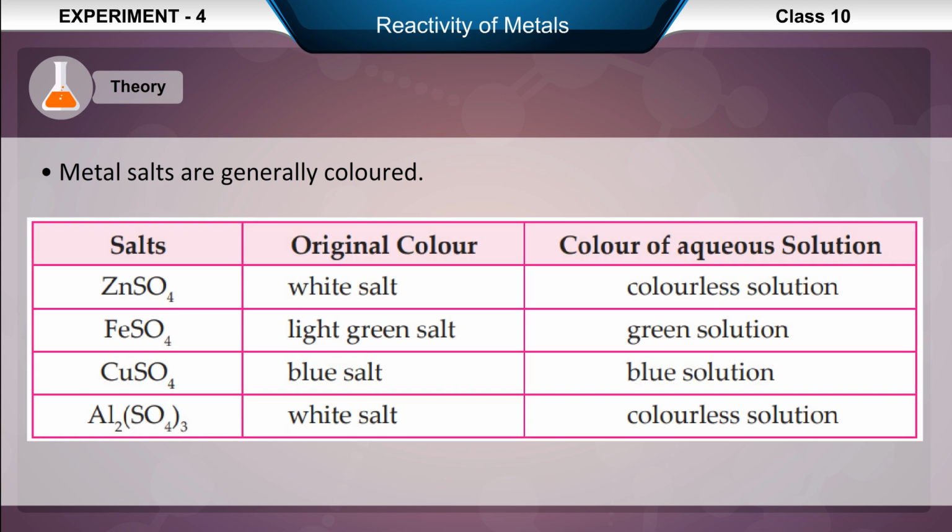Salts. ZnSO4. Original color: white salt. Color of aqueous solution: colorless solution. FeSO4. Original color: light green salt. Color of aqueous solution: green solution.